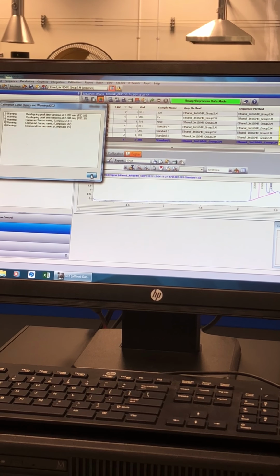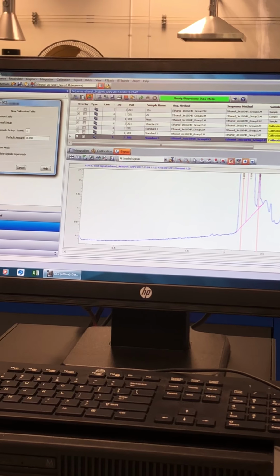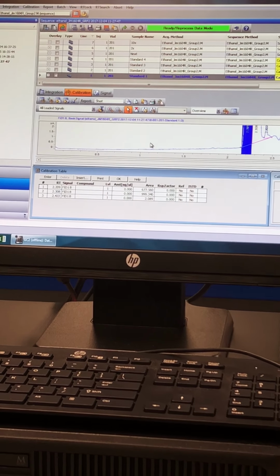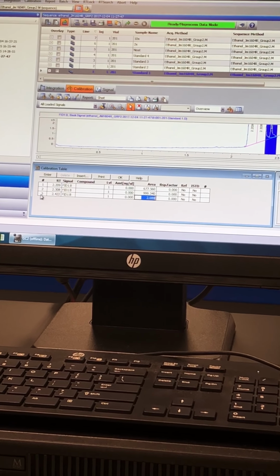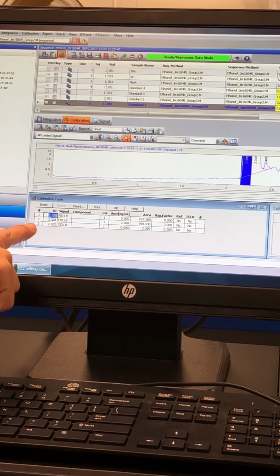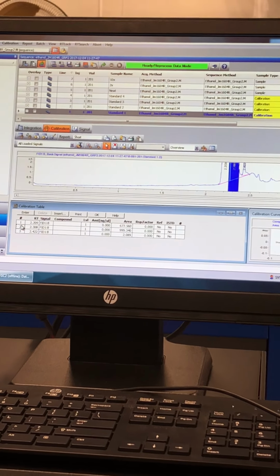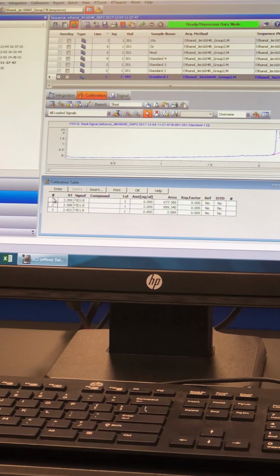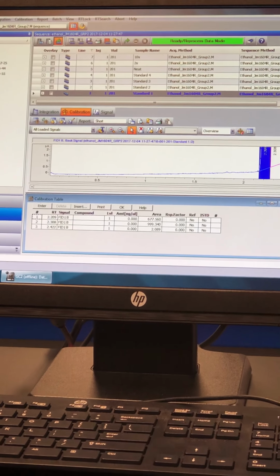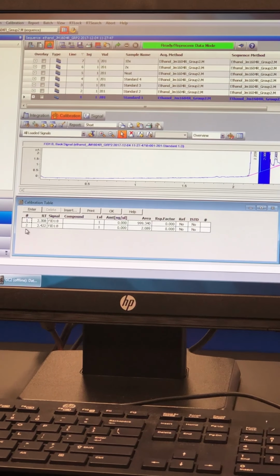There will be a few rows, correct? Do you have a few? You only have one, okay, then fine. The rest would have a few rows. Select the row that has your retention time that you have just identified, which is 2.3, right? 2.308, the second one. So that one is your target compound retention time. The rest you will delete. How to delete? Bring your cursor to the side of the table until you see a bold dark arrow. Do you see that? Yours no need. Then you delete this one.